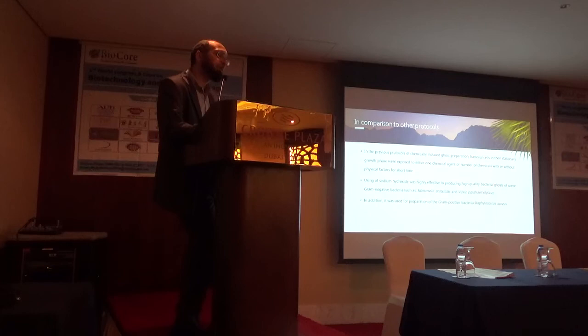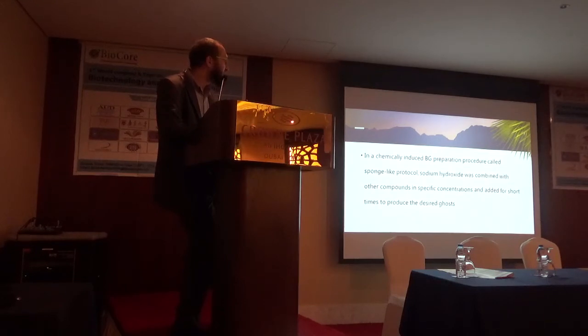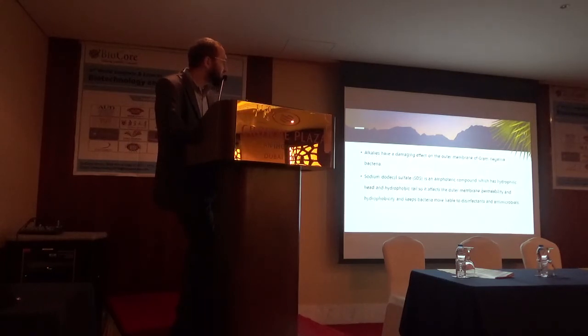for preparing both gram-positive and gram-negative bacteria, for example, Vibrio cholerae or Vibrio parahaemolyticus and Salmonella enteritidis, and Staphylococcus aureus. But sodium hydroxide has a very drastic and destructive effect on the external shell, and this actually breaches the high quality of the bacterial ghost. So we cannot use sodium hydroxide, even though some colleagues use it and their trial was successful.